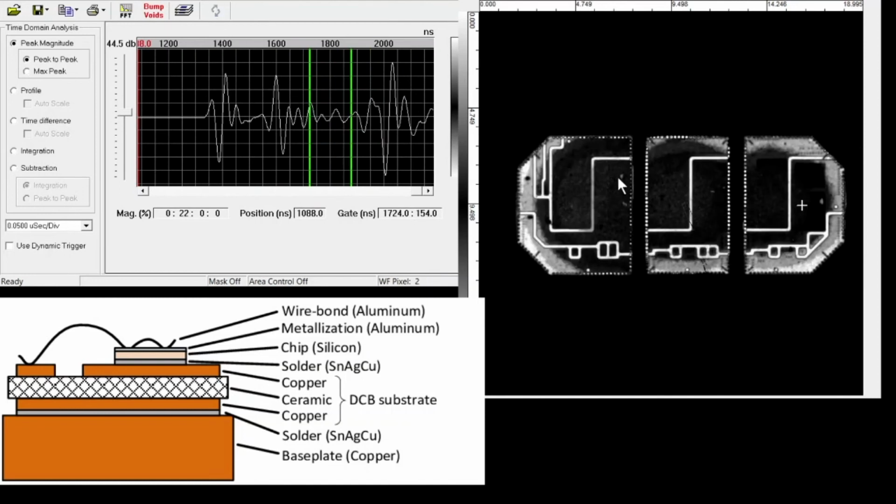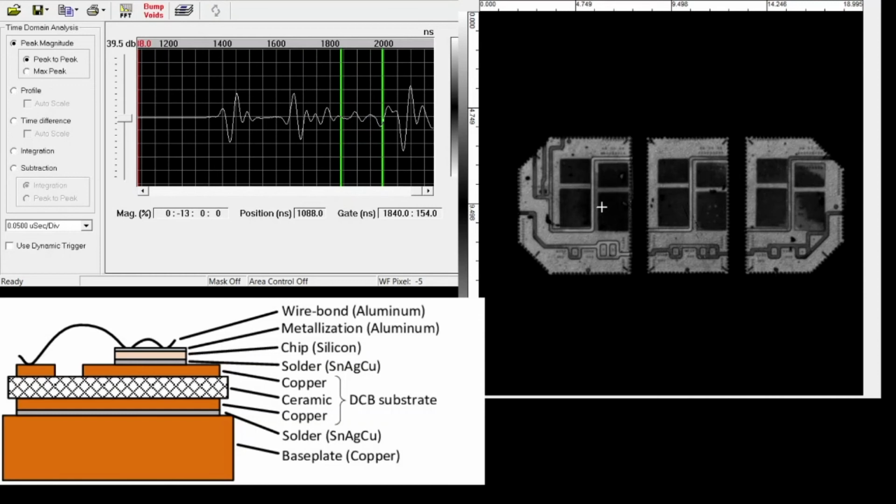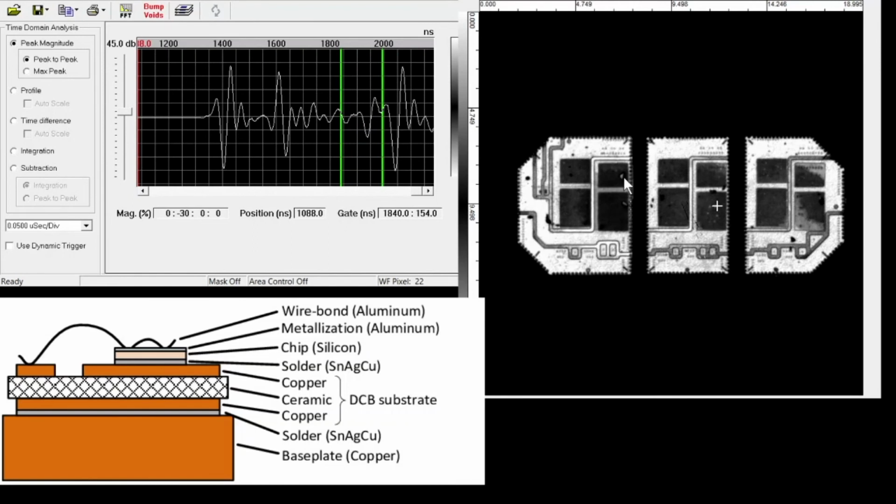And there's a couple more here. Let's go a bit deeper. We should come on to see, we're now beyond the copper, the last final copper layer, and we're now at copper to solder or die attach, and this interface is now showing us die attach. So let's improve that a little bit and get a bit more clarity, a bit more gain, refresh. So there's a couple of voids coming up now. Let's zoom up so we can see that more clearly.